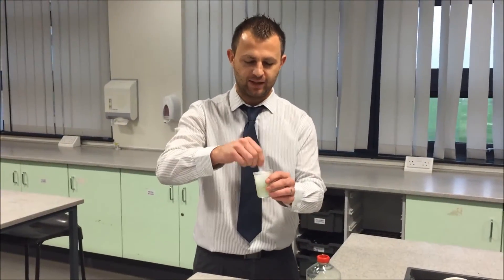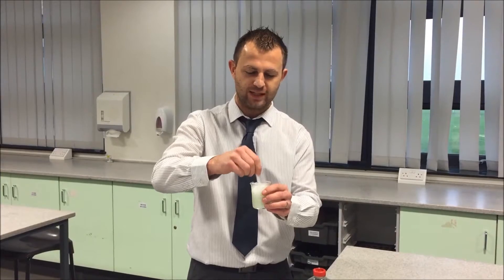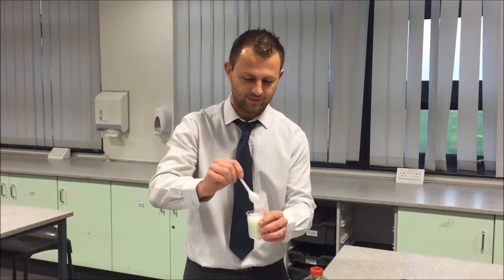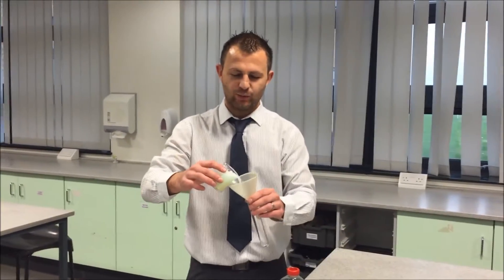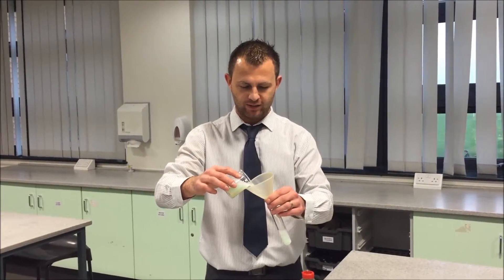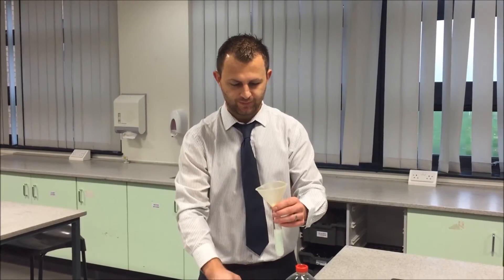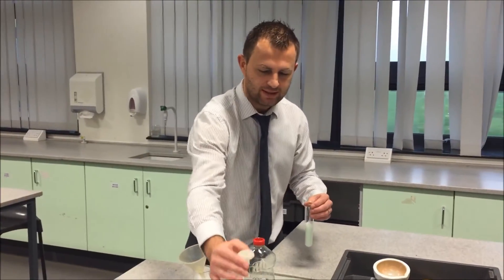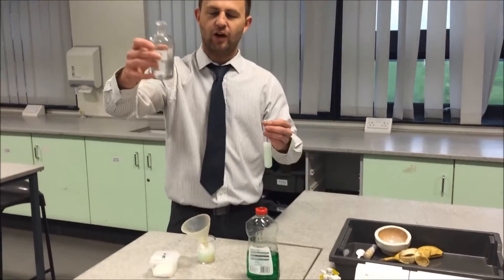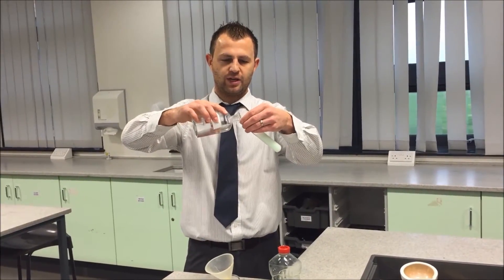We need to mix our mixture and leave it for about 10 minutes. We would then need to filter our mixture, and then add a small amount of ice-cold ethanol to it.